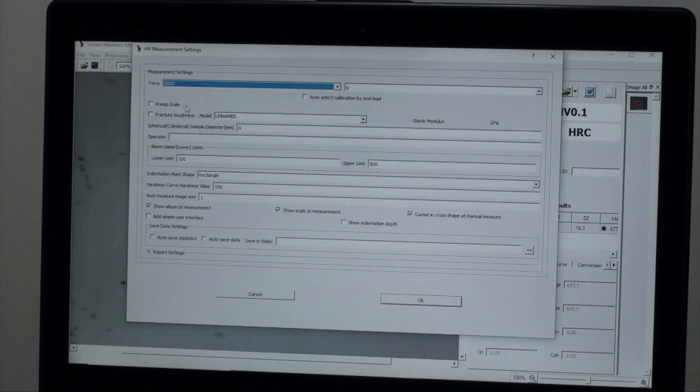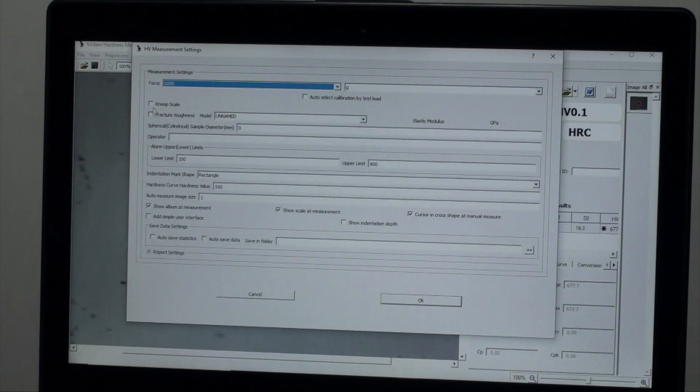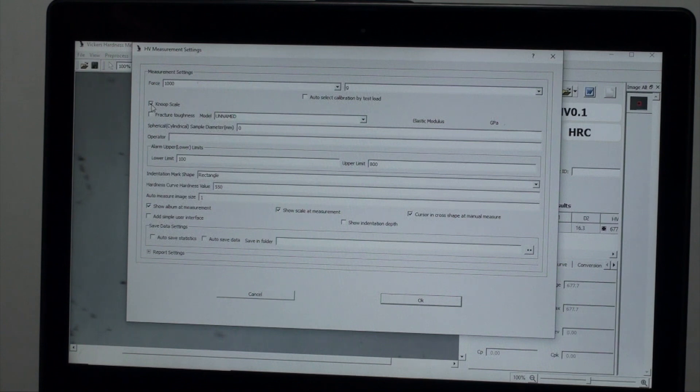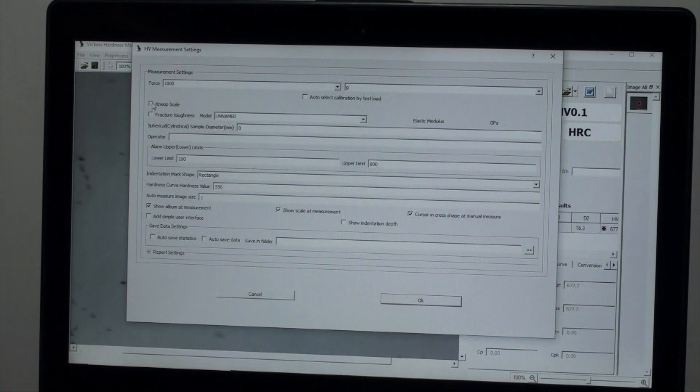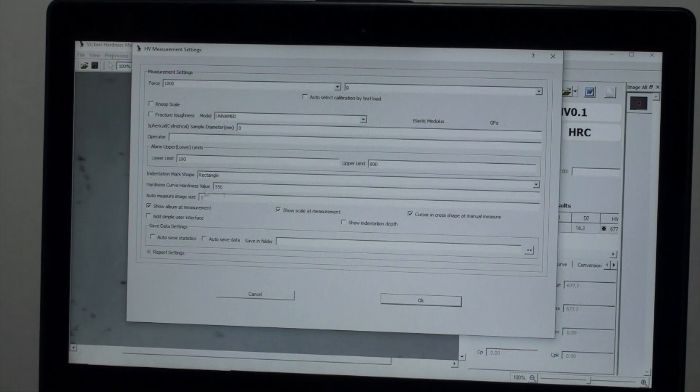If you intend to do Knoop scale testing, the check box here must be marked and your penetrator must be swapped from a Vickers style to a Knoop if you don't have a multi-penetrator turret. On this screen you can also set up upper and lower test limits, reporting formats, and other parameters.